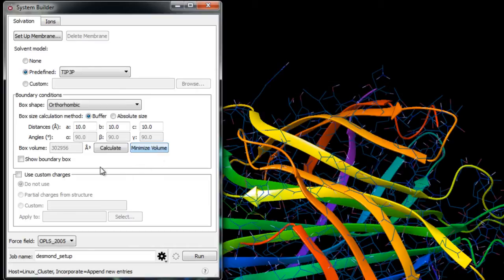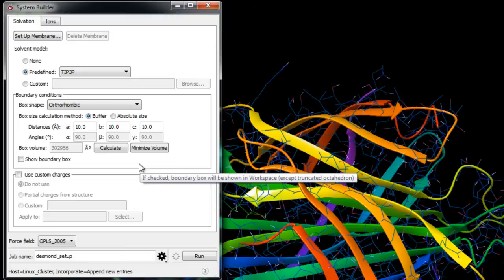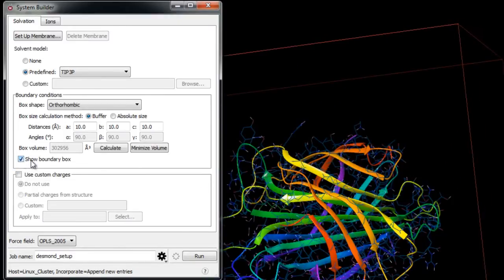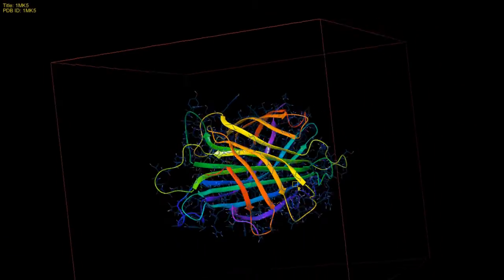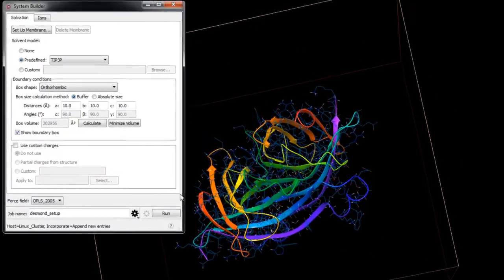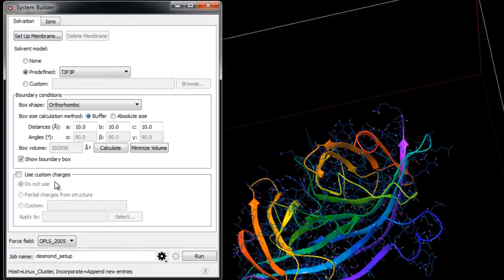We can also see the boundary box here. We won't use any custom charges, but we do need to set up the ions.